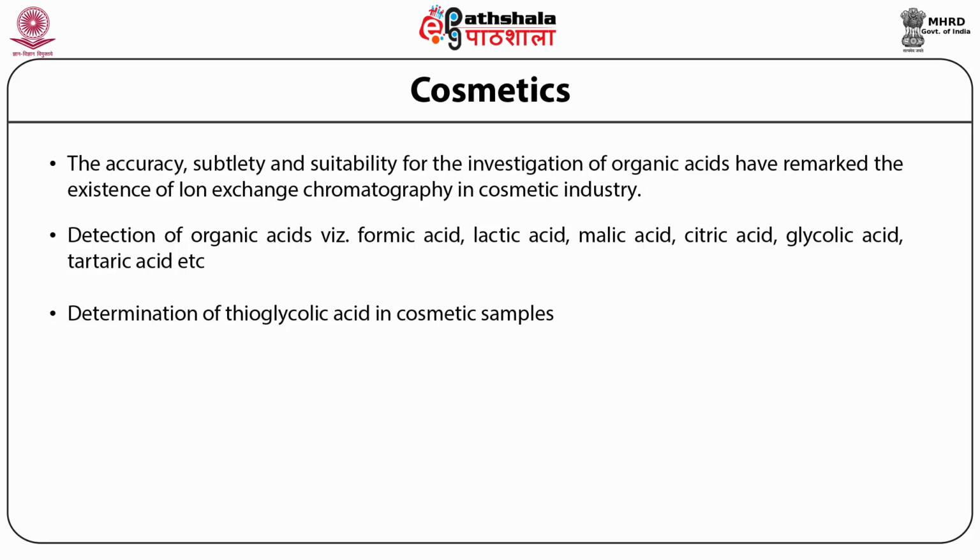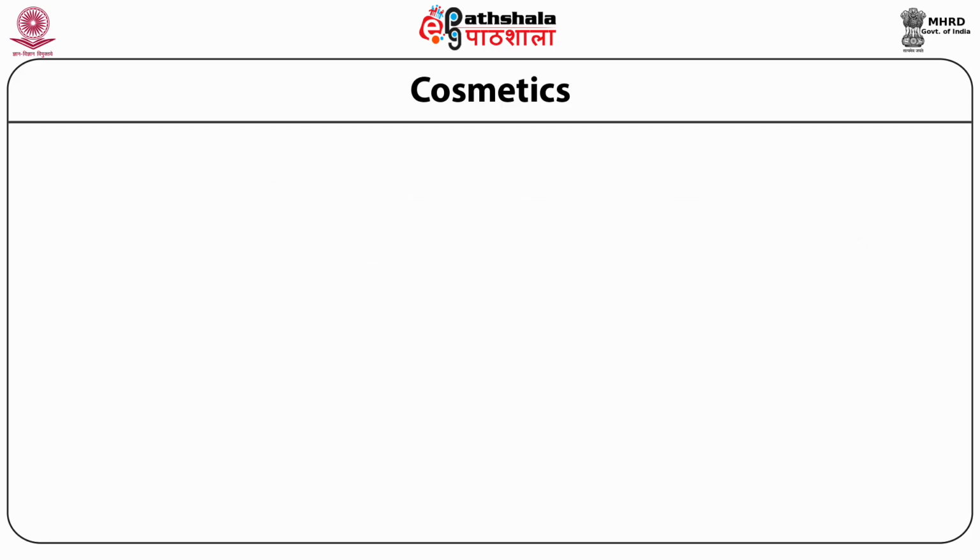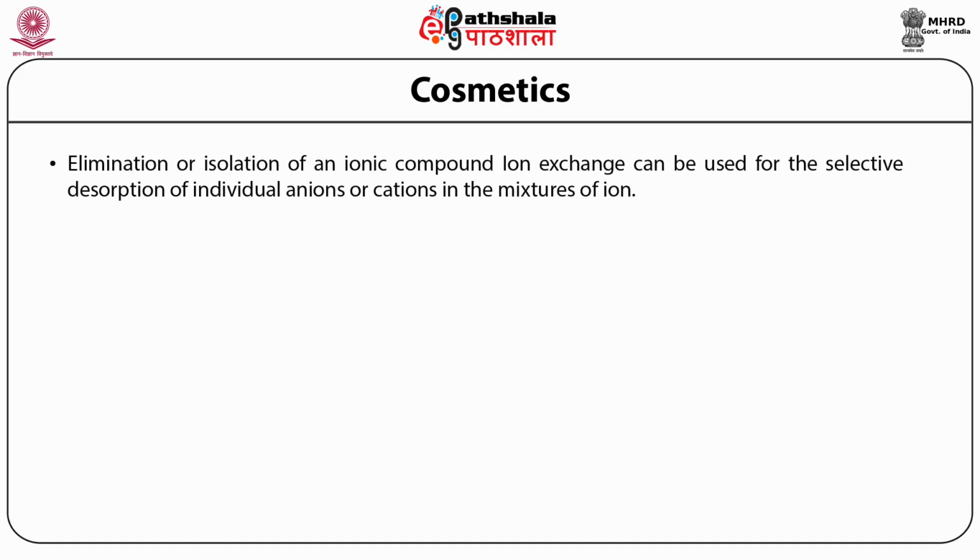conductivity detection. Ion exchange chromatography benefits whenever the analytical problem consists of elimination or isolation of an ionic compound. Ion exchange can be used for the selective desorption of individual anions or cations in mixtures of ions.